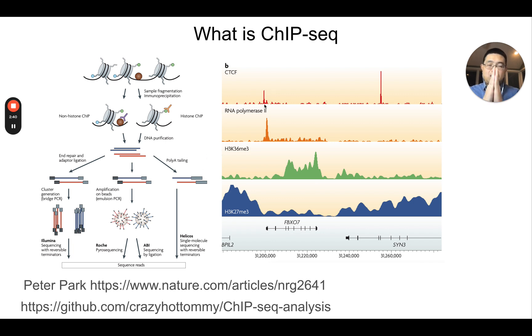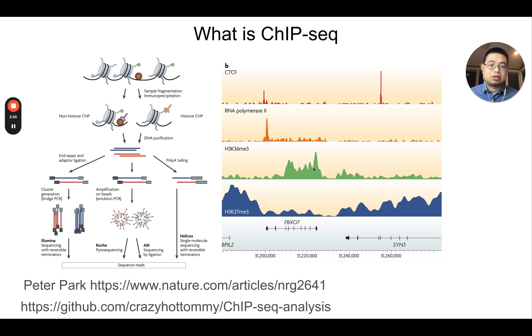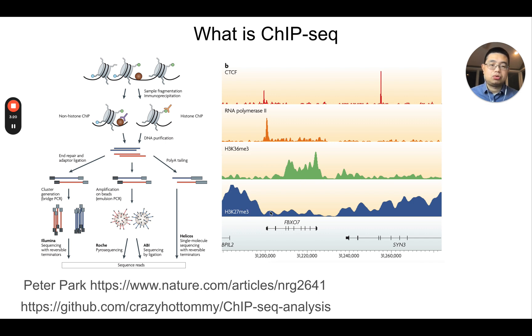For transcription factors, the signal is usually very sharp — for example, CTCF shows a really sharp peak. But for histone modifications, you usually see a more diffuse pattern. For example, H3K36 trimethylation is a known marker for gene bodies that are actively transcribed. You can also see RNA polymerase 2 binding to the promoter region of the FBXO7 gene. H3K27 trimethylation is a known heterochromatin marker, so genes covered by it are actually silenced — giving a roughly mutually exclusive pattern with H3K36 trimethylation. ChIP-seq lets you identify those regions and is a popular technology to study gene regulation.